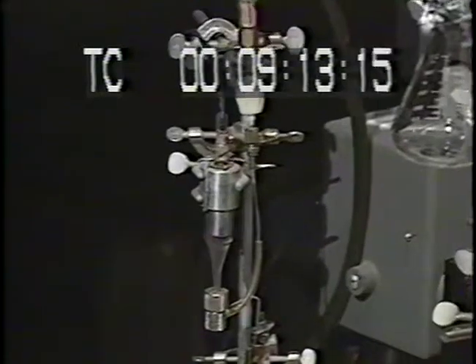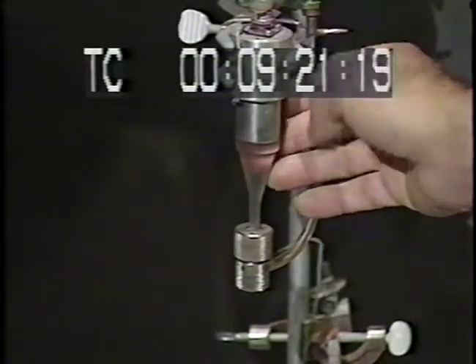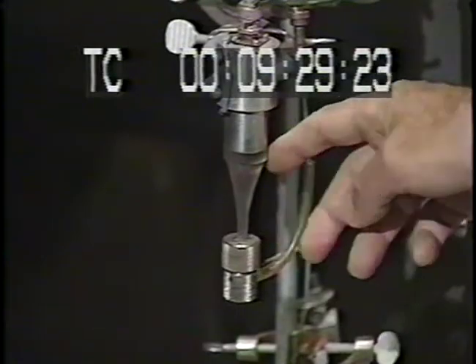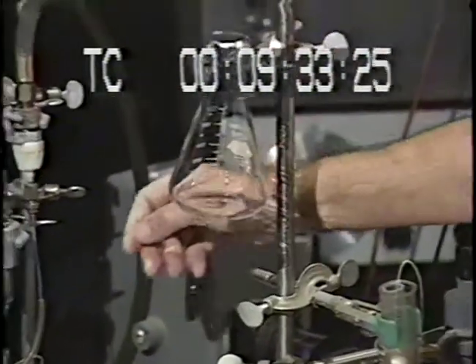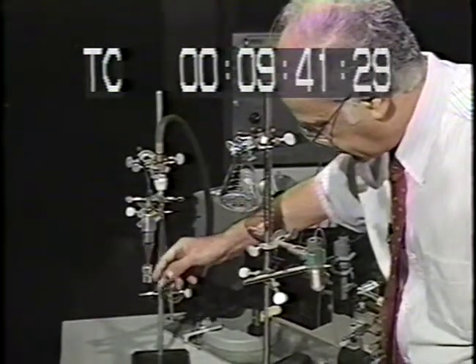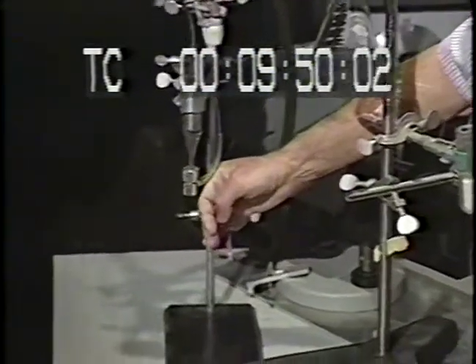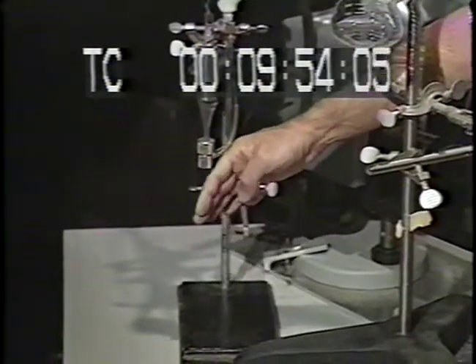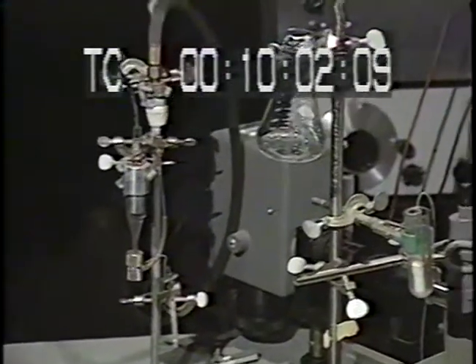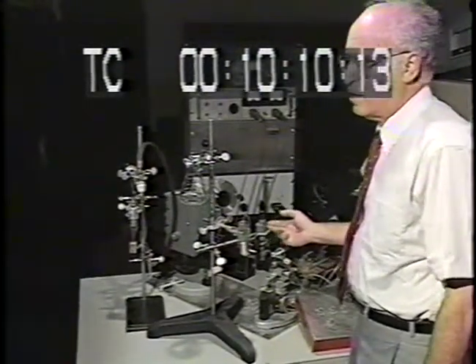Specific on the sorter that you should point out? This is a plastic rod that oscillates, vibrates, driven by the instrument in the back, the oscillator here. And the liquid is fed into this oscillator, and the droplets come at the bottom of this. And here I should have had the separator plates to have the droplets go one way or another, but I never added that part because I discovered that my uses of the instrument for my research were more analytical than anything else.